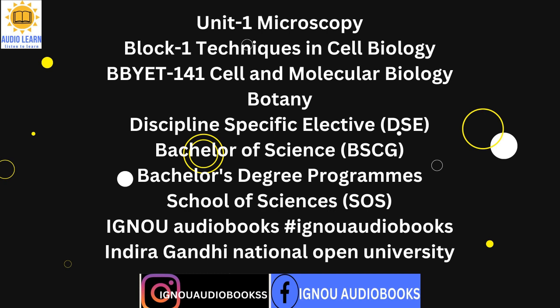Electronic detectors such as a complementary metal oxide semiconductor (CMOS) or charge-coupled device (CCD) chip are used to capture the magnified image in modern-day microscopes. The digital signal obtained is transmitted to a computer and translated into an image on the monitor. The pictures as well as moving video sequences are captured using software.